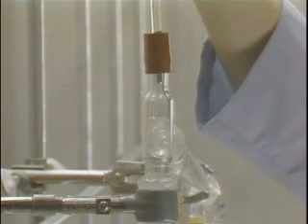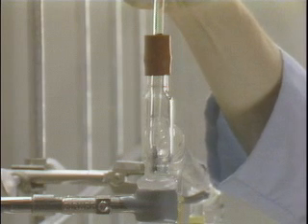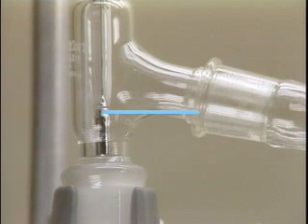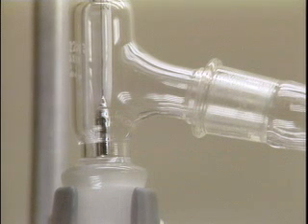When the equipment has been aligned and tightened, an adapter is placed at the top of the distillation head and the thermometer carefully placed in it. The top of the bulb of the thermometer should be set even with the bottom of the sidearm opening of the head. In this way, the heated vapors which will form during the distillation will pass over the thermometer bulb. If the bulb is placed too high, the vapors will not reach it, and the observed boiling point will be too low. If it is placed too low, the correct boiling point of the collected distillate may not be obtained.